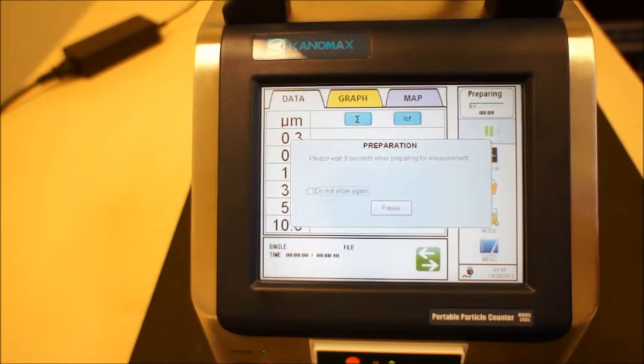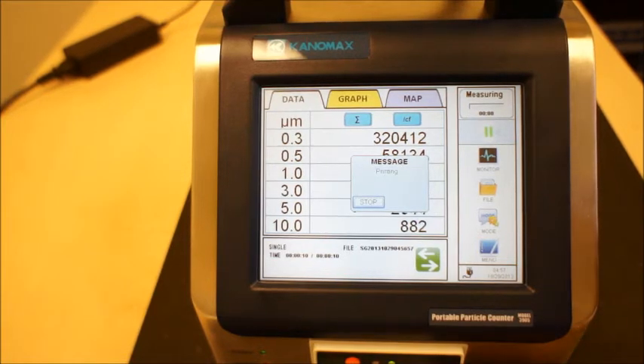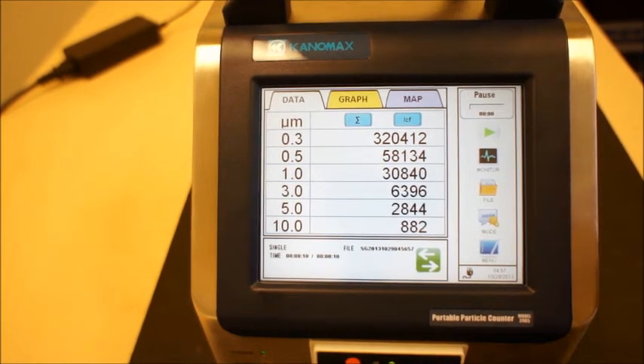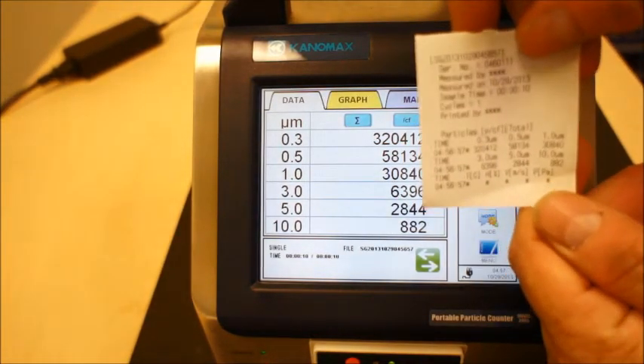The unit will wait 10 seconds preparing for measurement so you can step away from the instrument. Once that 10 seconds is reached, you'll see that it is counting, going through the cycle that you've asked it to on a single determination. Once it completes, it will print out the data and save the data in the instrument as seen here.